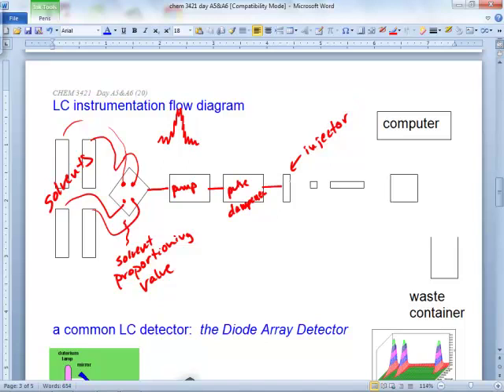And then now you have to have a column, right? That's going to be like dissolves like, and you're going to put whatever kind of stuff you want in there. And it's called the analytical column. It's the long one. So you finally injected stuff, and you're ready to get it separated. The problem is that this guy costs around $700 to $800, and it's really easy to clog. I should have some little demonstration things. You've seen like little tiny wire, like copper wire. That's what the tubing looks like for this stuff.